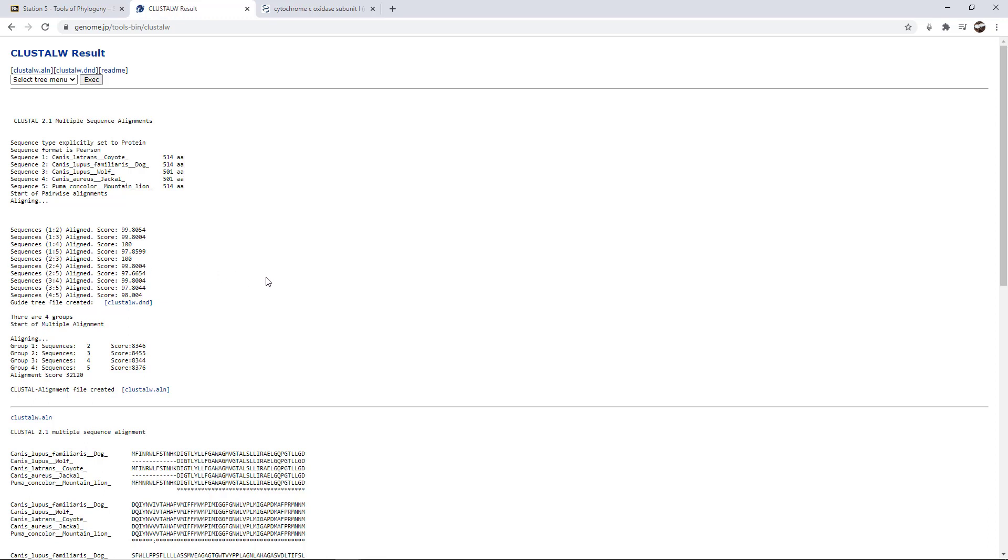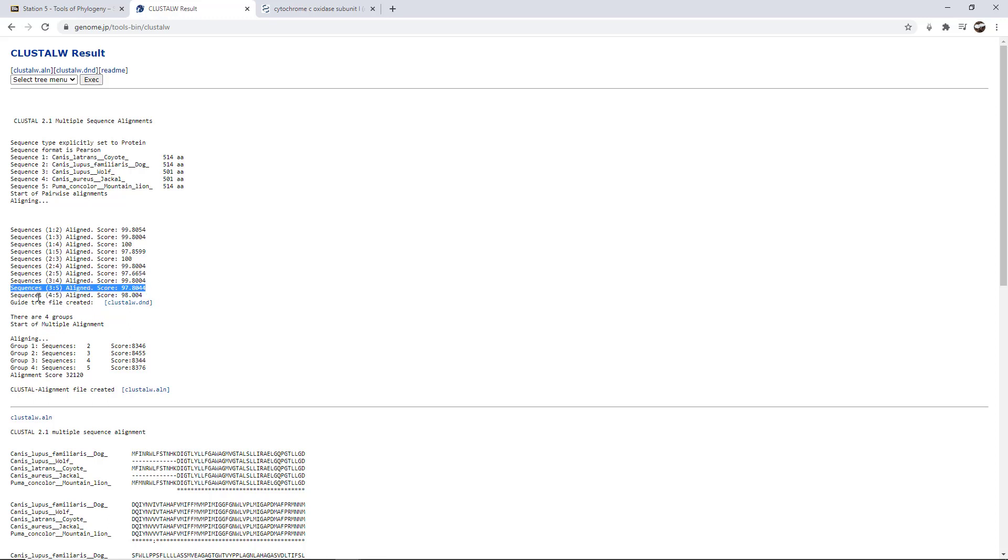So we've got some really high similarities, but then when it comes to comparisons to sequence 5, they're not quite as high. They're still pretty high. If I look at here at sequence 5, 2 to 5 is 97, 3 to 5 is 97, 4 to 5 is 98, but they're not as high as 99 or 100.